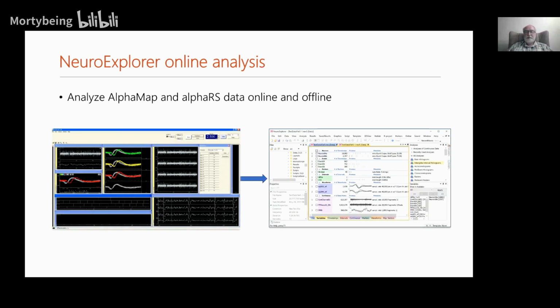I see. So it's kind of a delay, right? Yes, delayed. Yeah, delay, but you can go as often as 3 seconds, but it's not something that recalculates all the time. There is a separate thread in the program that reads the data. So the data acquisition is not interfering with analysis, but it's a little delayed. Yes. Okay, thank you.